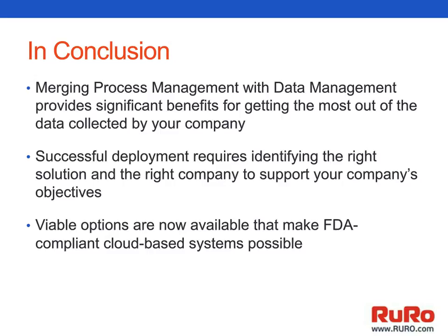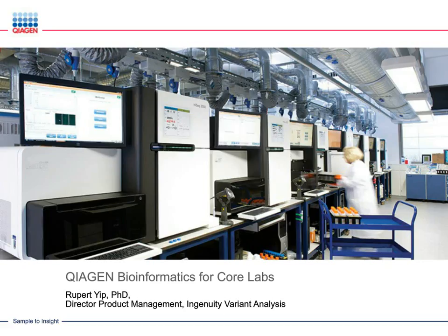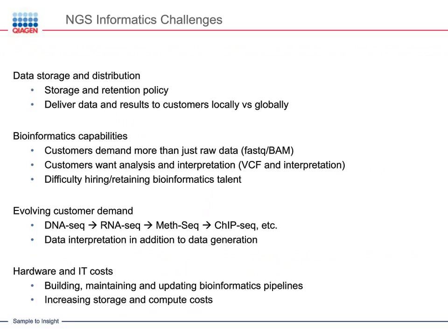Thank you, Trevor, and thank you for having the opportunity to talk about next-generation sequencing big data management. First, I'd like to frame the discussion by talking about some of the next-gen sequencing, NGS, informatics challenges. A lot of customers who are embarking on an NGS capability for their lab face tremendous challenges with regards to data storage and distribution. So things like the vast amount of data that's generated by these sequencing machines, as well as how to deliver these results to their customers, either locally or globally.